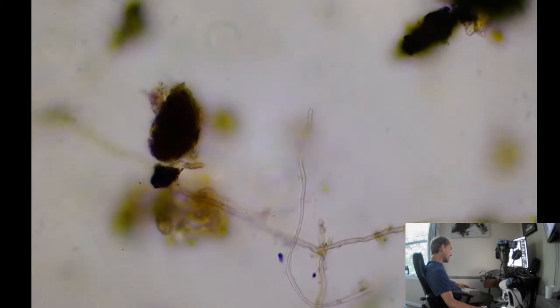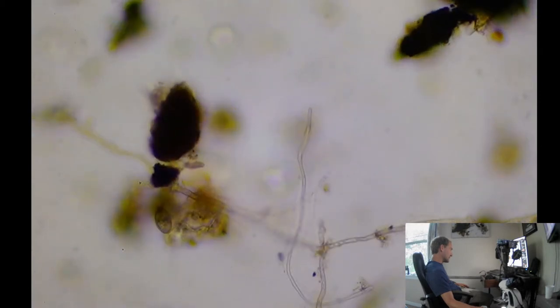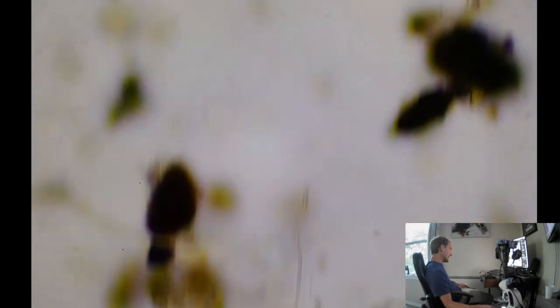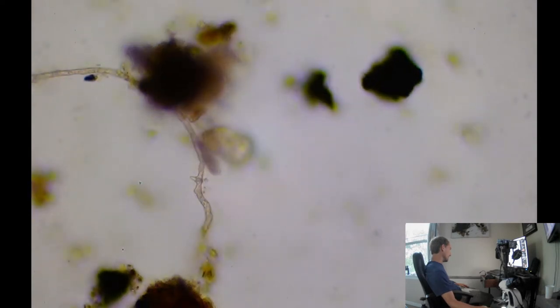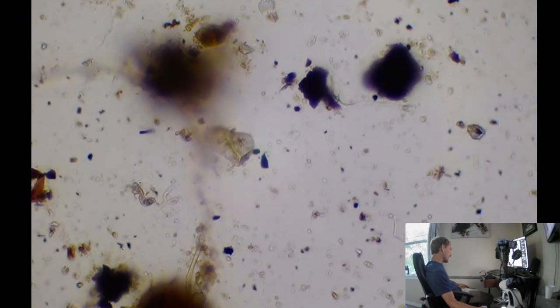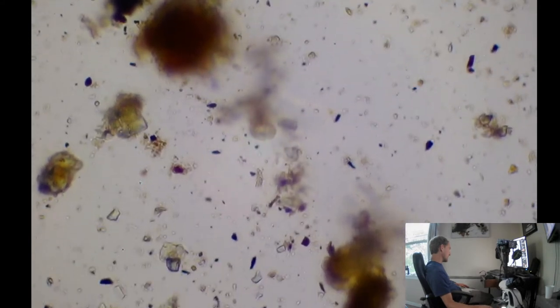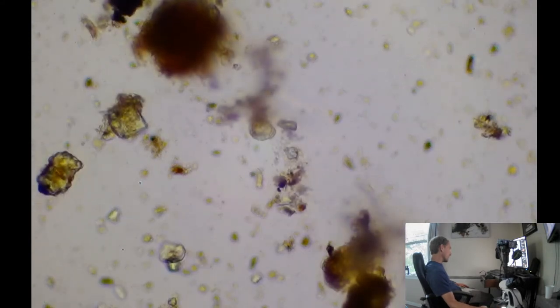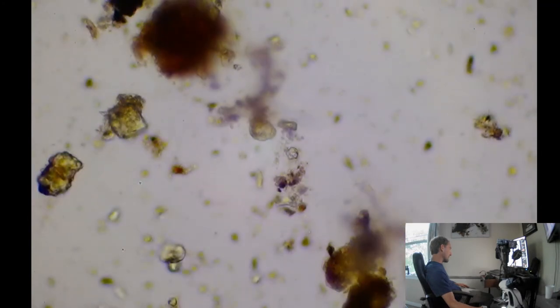Looking for some good septa. That's kind of bumpy. Let's see. Yeah, I'm not seeing the separations in the cell wall that we really want to see there. I can continue it over here. Hopefully it's not an oomycete. But it could be a different type of fungi.